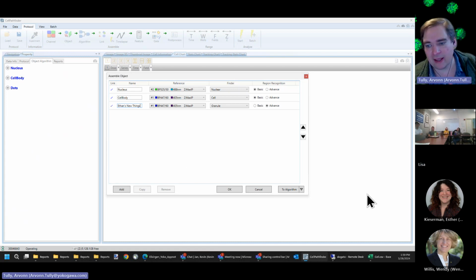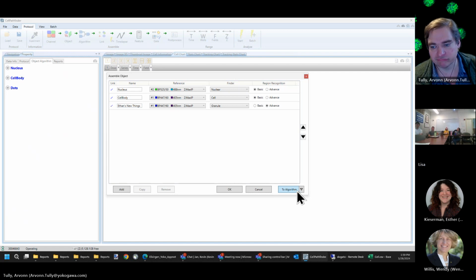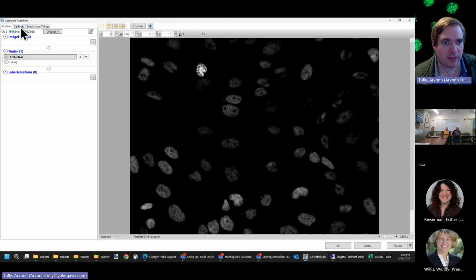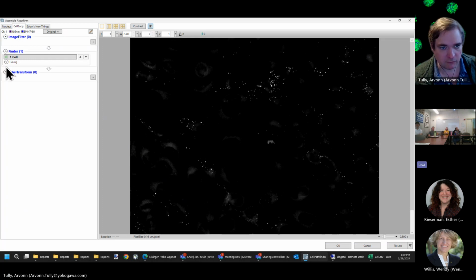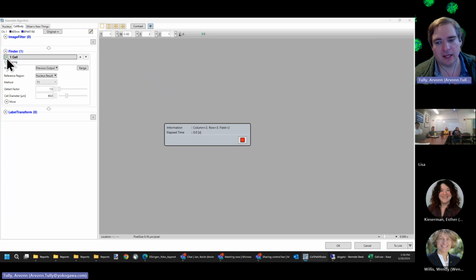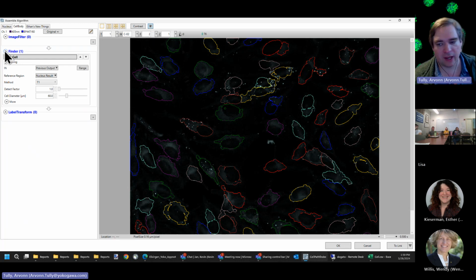It's Ethan's new thing now, so you can call it whatever you want. It's just an arbitrary label. You should give it something relevant so that when you come back like 6 months later, you're like, Ethan's new thing. Oh, well, that's Ethan's old thing now. What the heck are we talking about? Dots is just what somebody thought was reasonable.